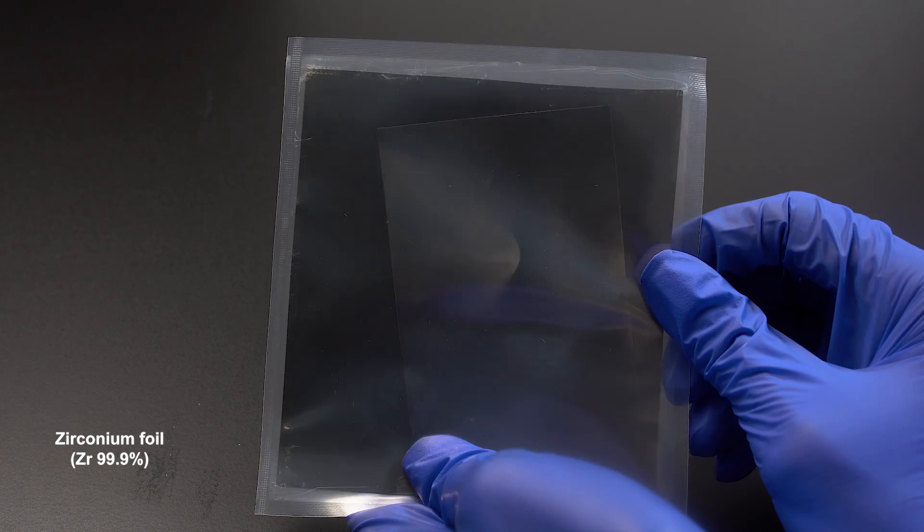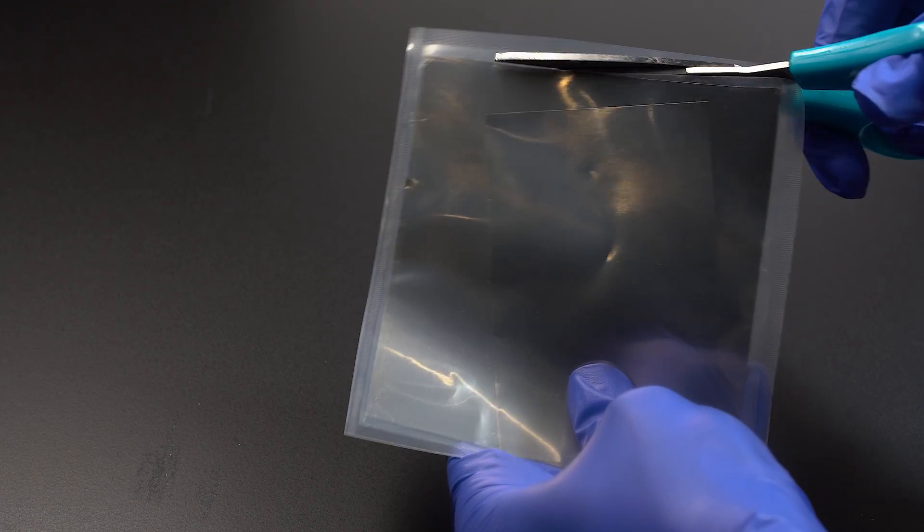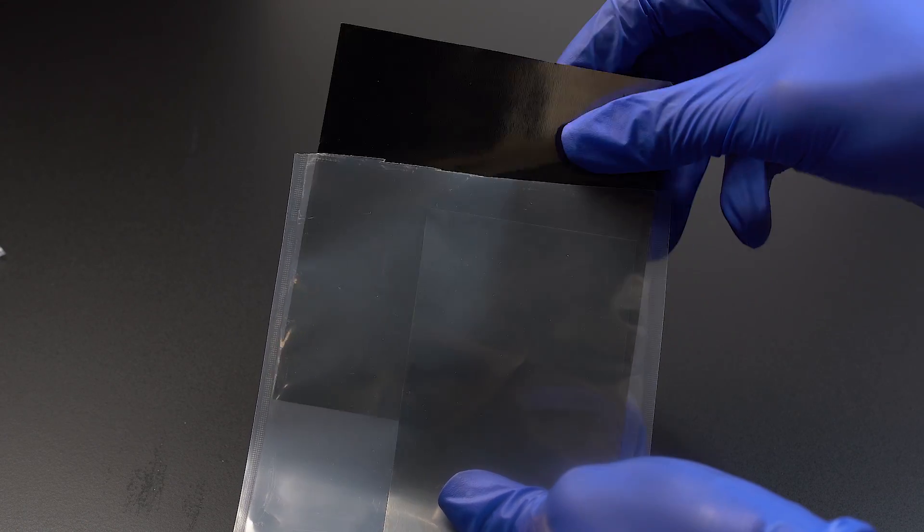Take a look at this sheet — it's zirconium foil. I will use it as a surface to crush the ampoule on, so that we can see the pink-purple, free-from-other-ions color of the flame in case rubidium lights up.